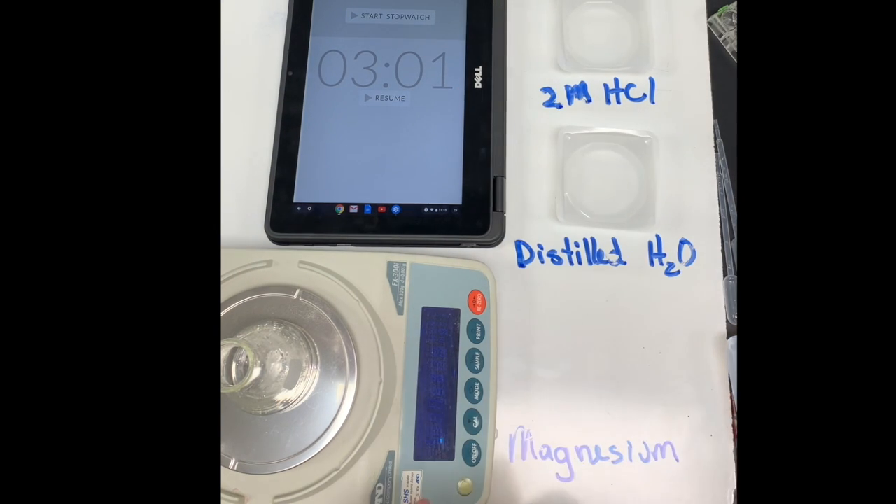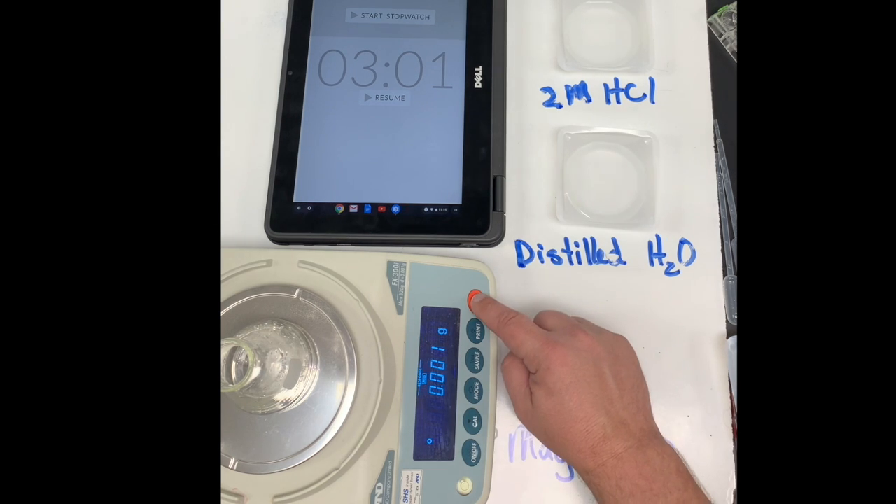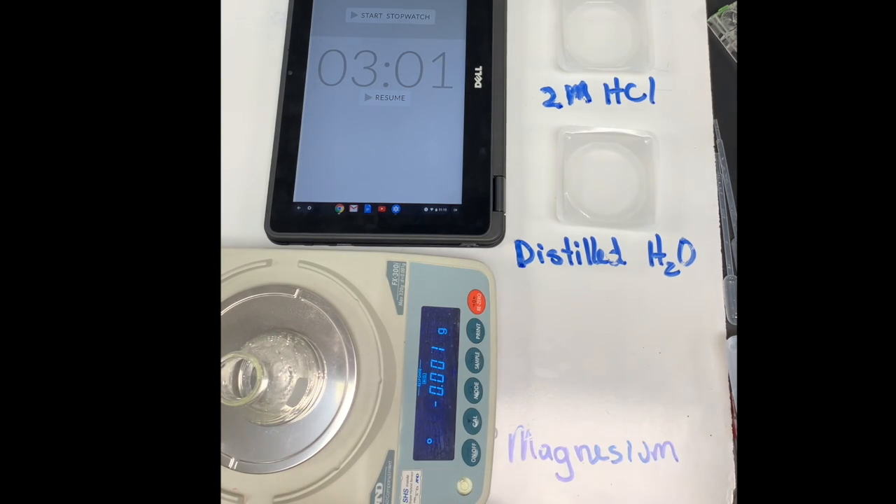Now we're going to run this experiment using mass. Let's start on our scale and we'll zero out the scale with our Erlenmeyer flask on there.